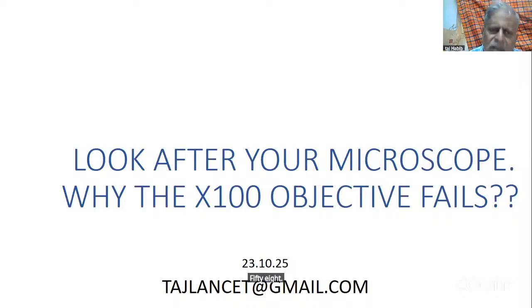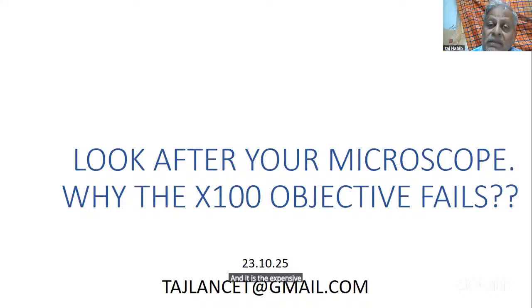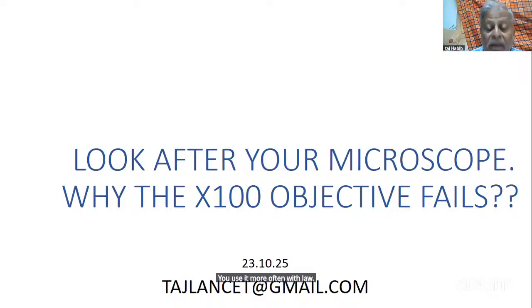It eats your microscope knobs. It eats your biro pen. It is sticky. It will not last you. Your power 100 will not last more than a year. And it is expensive. Power 100 can be as expensive as 40,000. So please look after your microscope. Use it more often, but look after it.